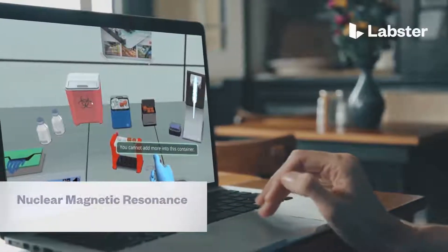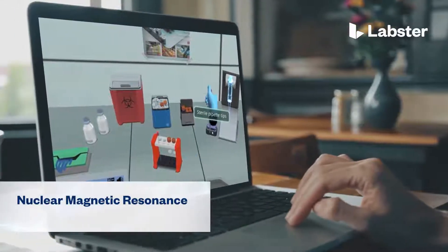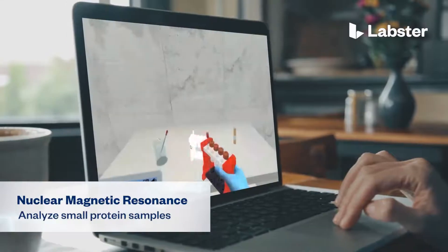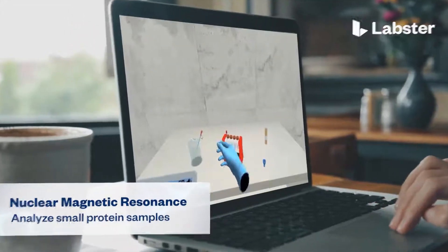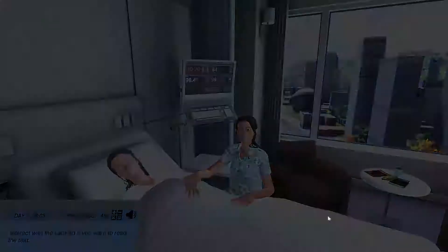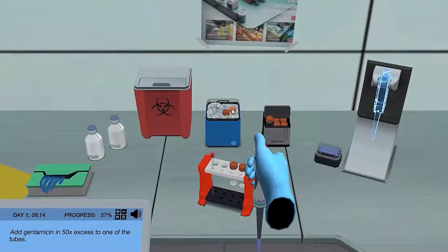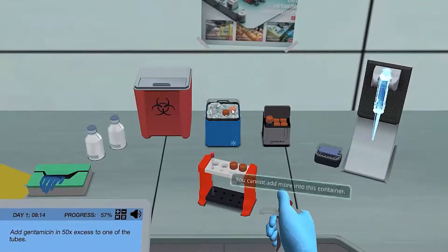In the Nuclear Magnetic Resonance (NMR) Analyze Small Protein Samples Virtual Lab, students step into a realistic lab experience where they can practice, learn, and explore science in an engaging and immersive way.